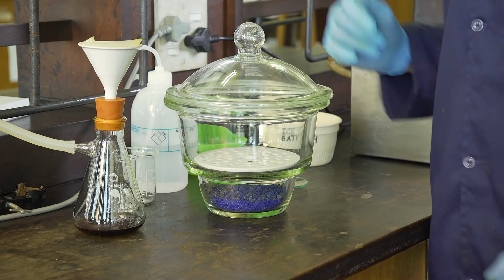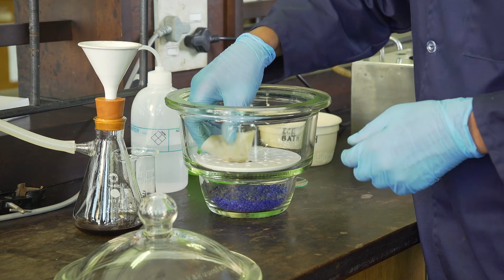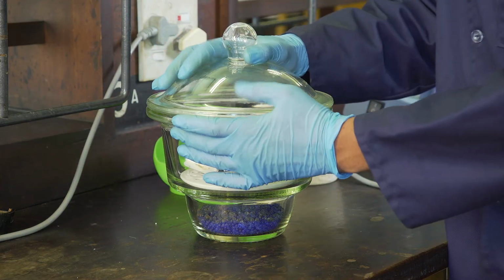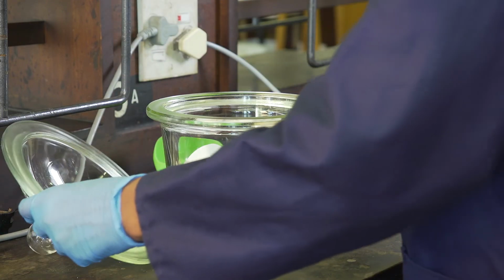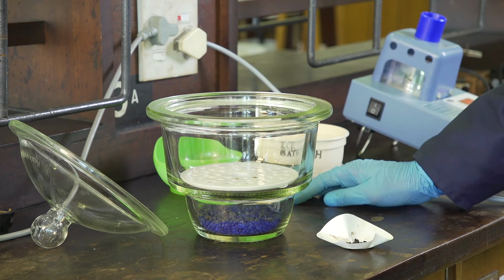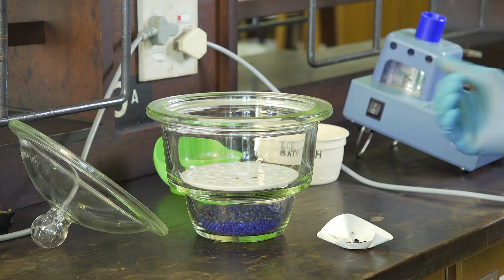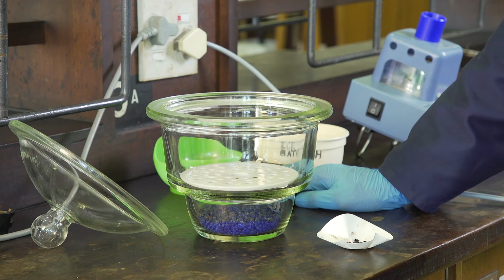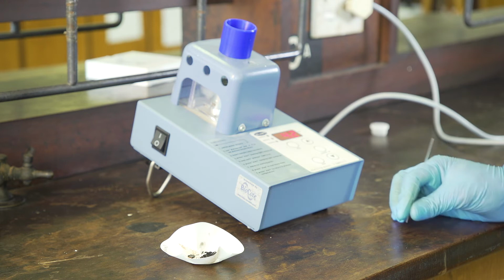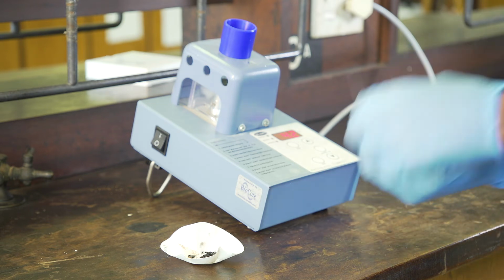Once our filtration process has been completed, we will then use a desiccator to dry and release moisture from our crystals and leave it overnight. Once our dark brown crystals have dried in our desiccator overnight, we will then accurately weigh them on an analytical balance and record the mass to 4 decimal places. And having pre-weighed our filter paper, we will then be able to determine the actual mass or yield of our dark brown crystals.